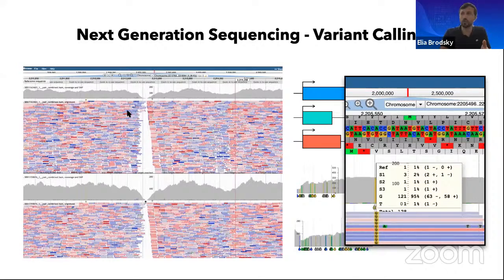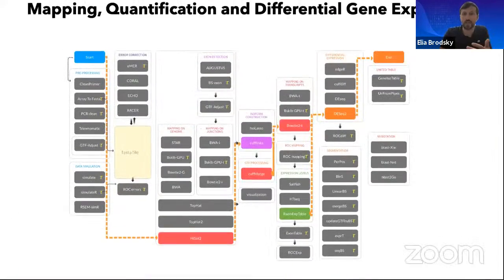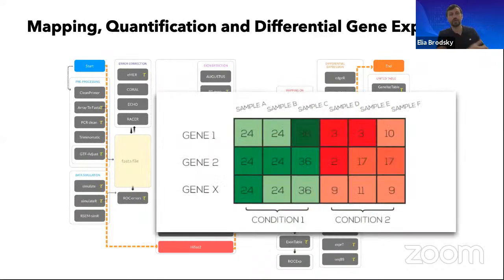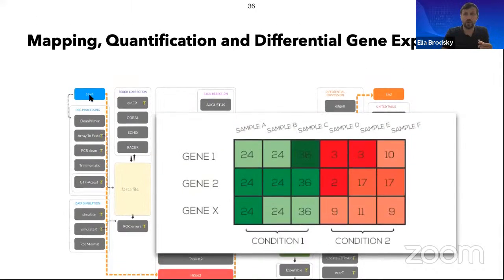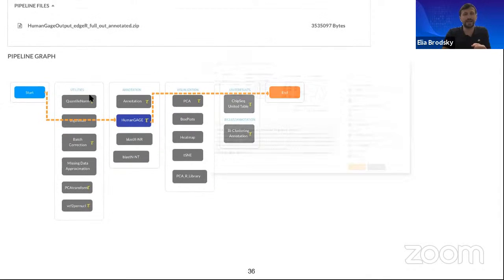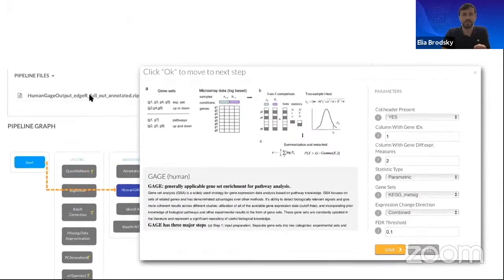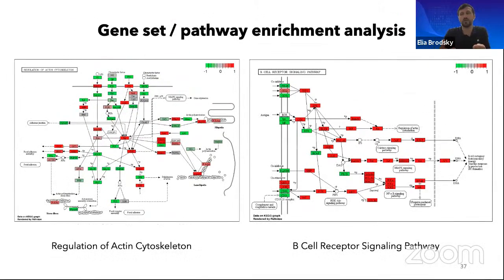specific positions at the DNA level that have a mutation or a change. We will look at the processing, quantification, and statistical analysis of mRNA expression data, including processing that data from raw reads to a table of expression and asking the question, how can we compare different conditions to see changes within specific genes? And we'll also think about how we leverage big databases where we can use annotation on gene ontology terms and pathways so that we can understand how the signal that we find in the data could be turned into biologically interpretable information.